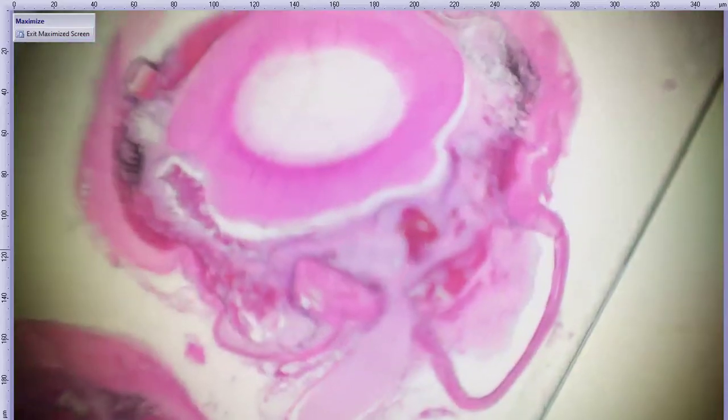All right. I'm actually going to just quickly show off the difference between the two globes on an attempted subgross here, but then we're going to focus in on one of the globes. So this is the right globe. So it's the one that was starting to get a little bit phthisical. It's kind of also a little bit covered in dust and so forth. If that helps at all, that does help.